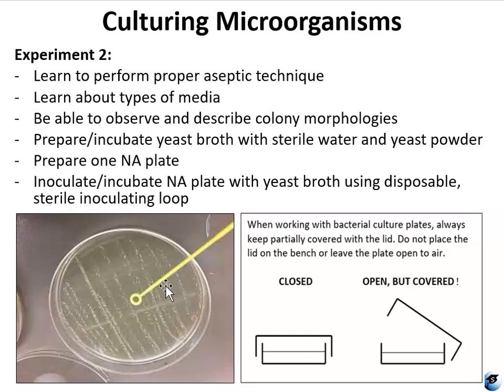And in order to dispose of them properly, you're either going to put them in the hard plastic bins, the sharps containers that maybe you made for the last lab. You could put it in that, something with hard plastic sides. Or you could even just put them in a Ziploc bag, put them in the trash that way. That would be fine too.